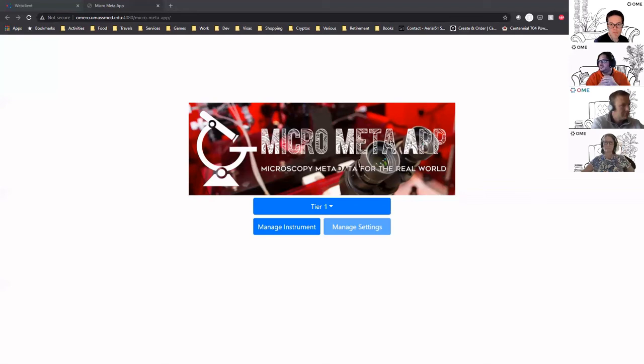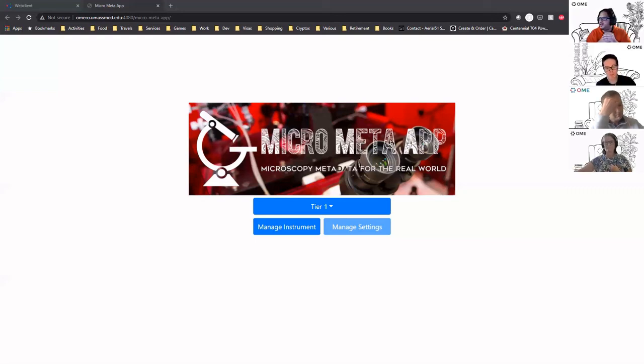Yes, Matthew. How many people do you have using it at the moment, particularly people on the more experimental end? So we have, I think, 12 for the paper that we are trying to publish right now. We have 12 laboratories doing test cases, and apart from some initial bumps and still bugs in the app, obviously, we got 12 microscopes with 12 image acquisition settings from 12 different images. It was a nice test case because some images had thousands of planes. And then you realize, how would you record thousands of planes if you cannot pull the metadata directly from the image?